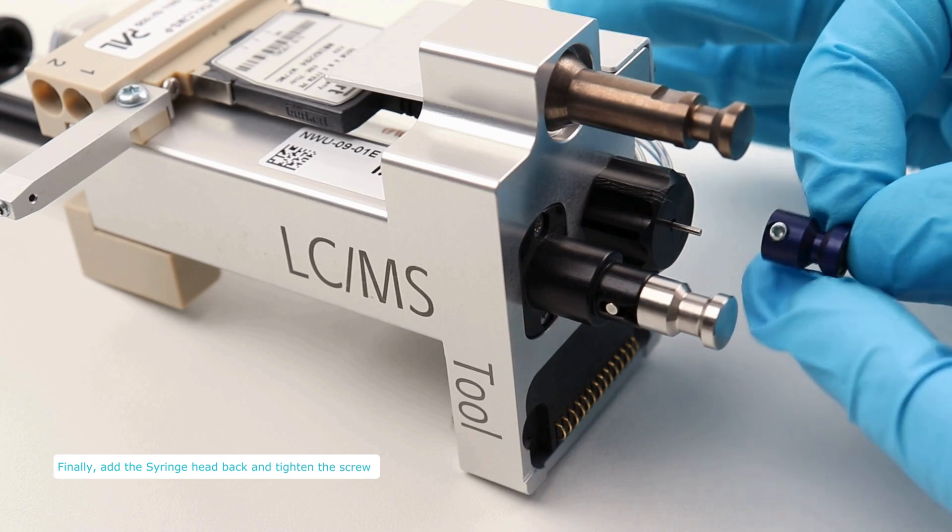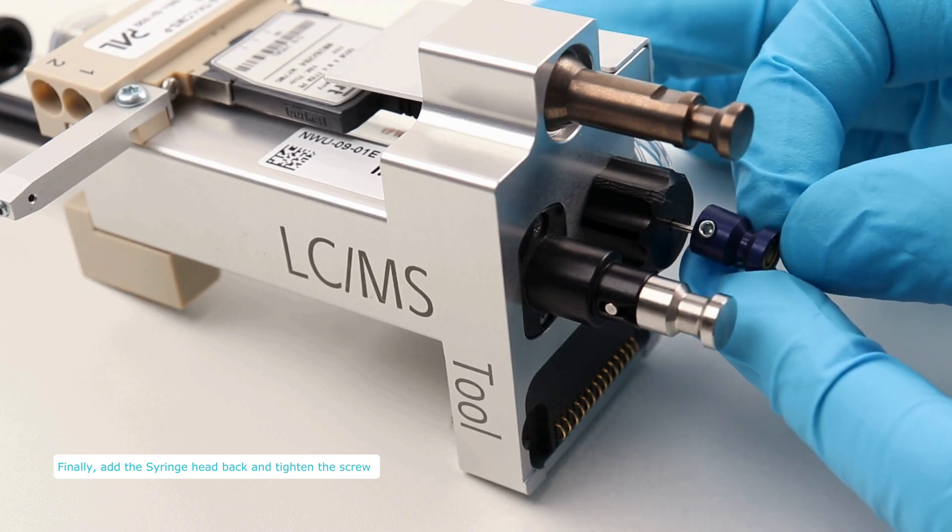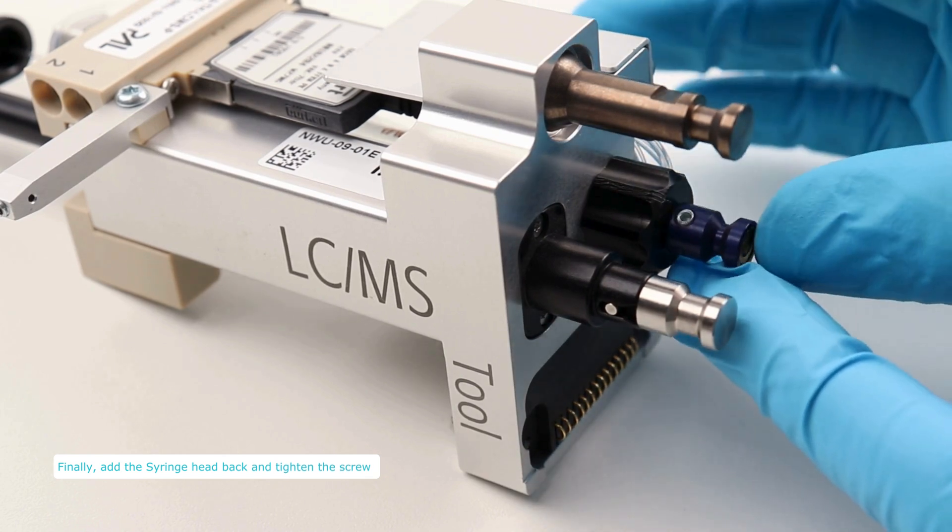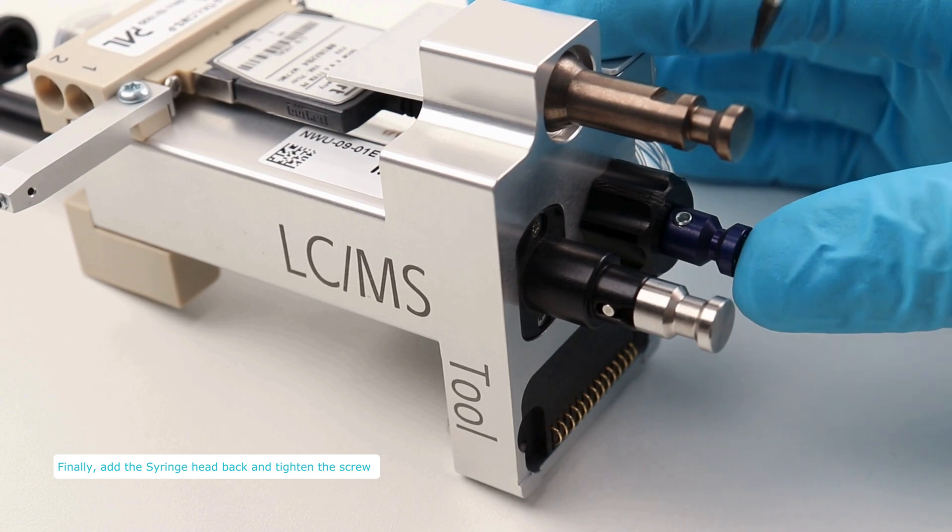Finally, attach the syringe head and tighten the screw. You can now put the LC-MS tool with its new syringe back to your PAL system.